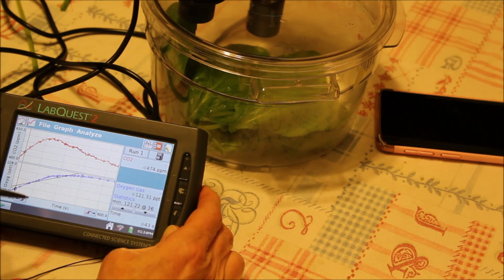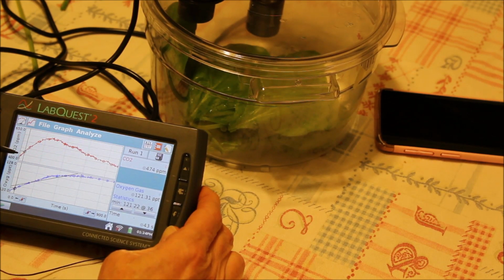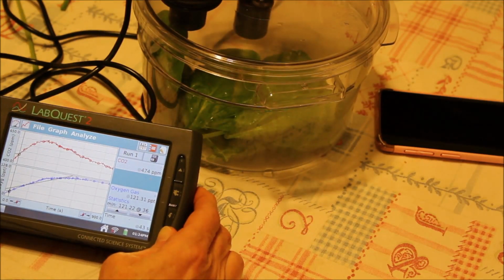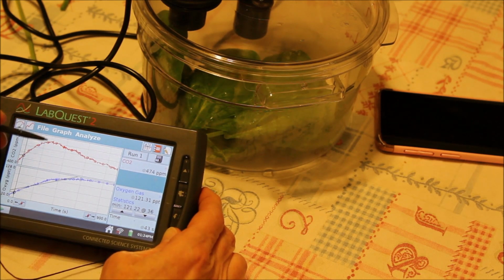What you will do now is analyze your data. At first, in order to warm up the carbon dioxide sensor, the red one, I had to wait a little bit, so I will not take that part into consideration.